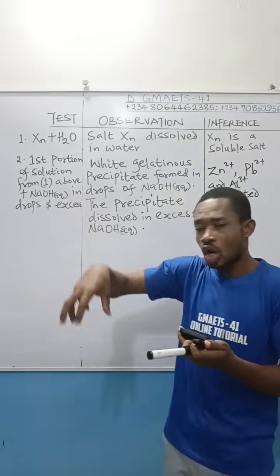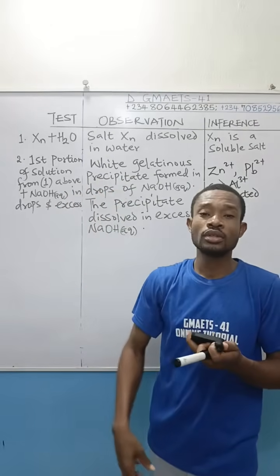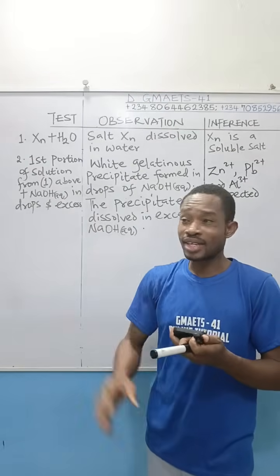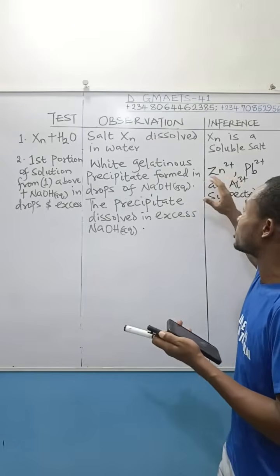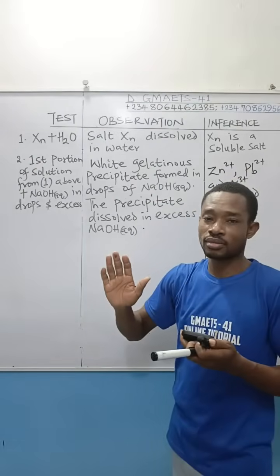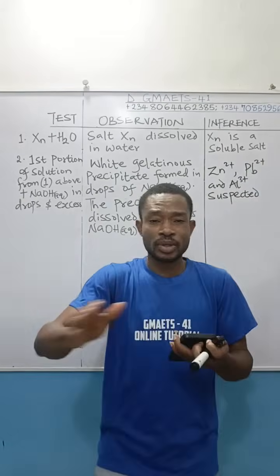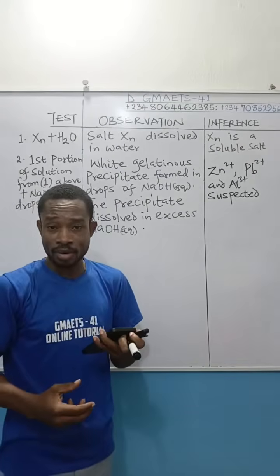If you pour chalk into water, even if you shake it for how long you want, it will still remain that way. In that case, you will know that it is calcium. You just come here and write calcium present. Are you following, right? So that of calcium is very simple to detect or discover in the laboratory.